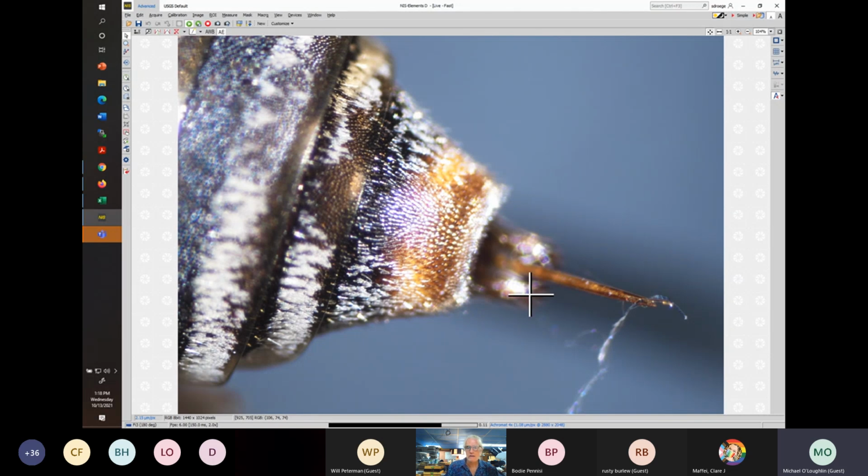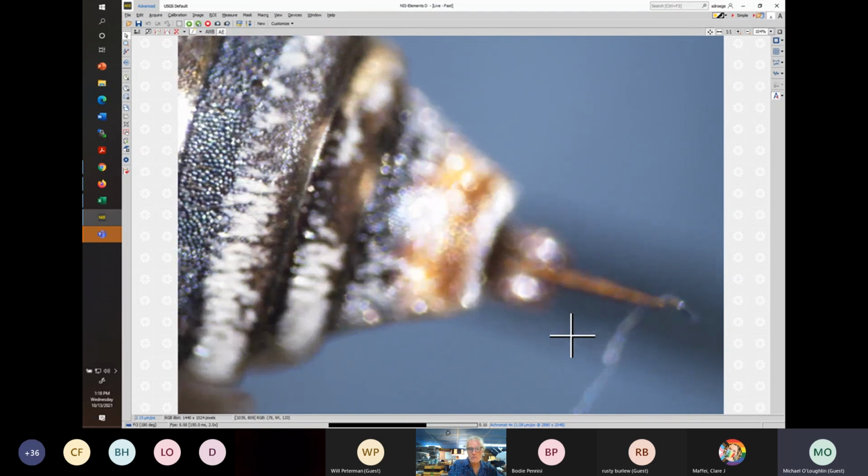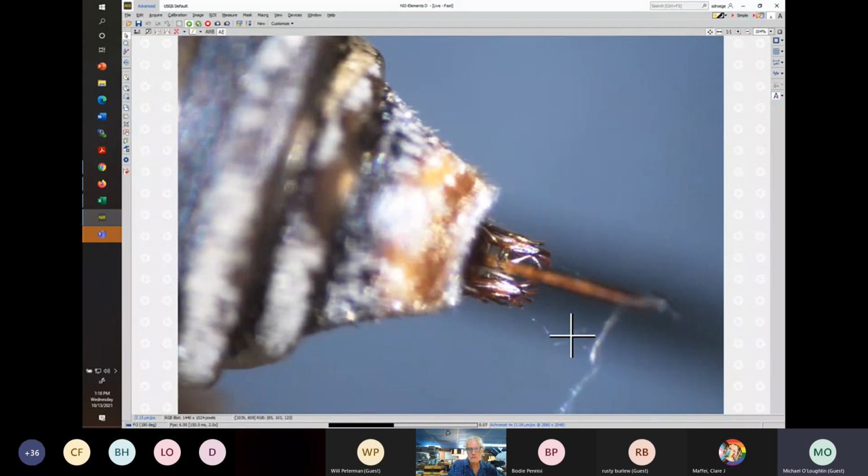Okay, so here's the sting, and these rods are poking out. Unless you pull them, they're almost never completely coming out. These are quite long. They're now in retraction mode. Fortunately, we can see them. A lot of times they're completely invisible because they're retracted.